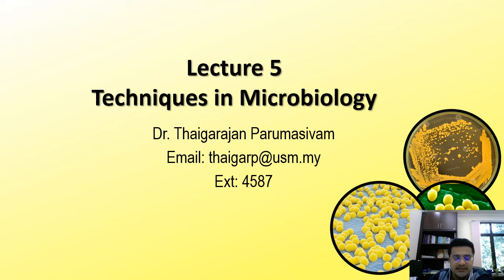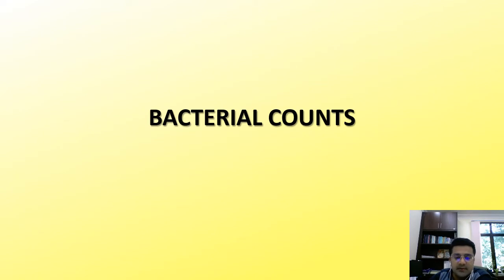Hi everyone. So this is the last lecture in techniques in microbiology. This lecture will cover bacterial count, which means we will learn the techniques on how to count the number of bacteria in a sample. And this lecture is quite relevant to practical too.